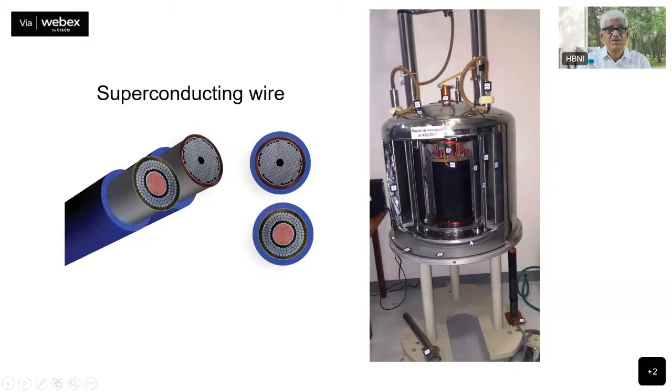So typically, for a 20 Tesla magnet, the total length of the superconducting coil wire is approximately a few kilometers. You can't imagine this. Few kilometers of superconducting wire is inside your magnet, and that is achieved by this sort of a situation. You have a copper wire which is actually a sink. You might ask, why do you need copper wire? Can I just do this?